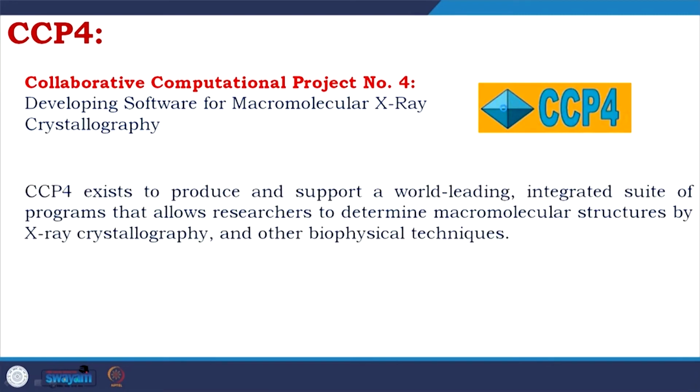CCP4 exists to produce and support a world leading integrated suite of programs that allows researchers to determine macromolecular structures by X-ray crystallography and other biophysical techniques. So, they started with X-ray crystallography, but now they definitely help cryo-EM, NMR, and other spectroscopic techniques could also get their analysis using CCP4.